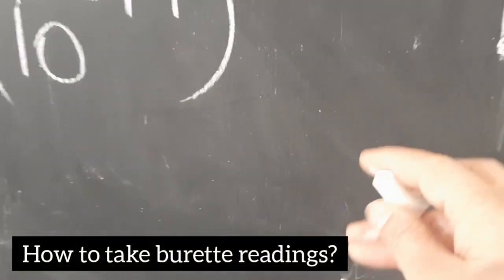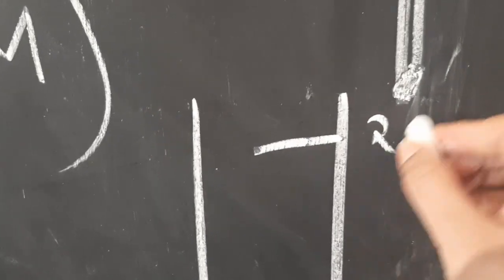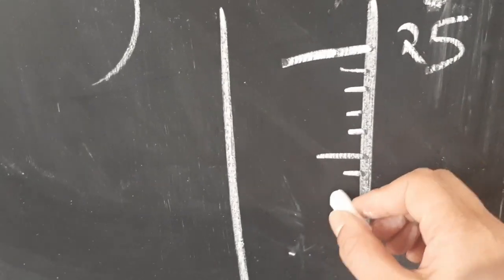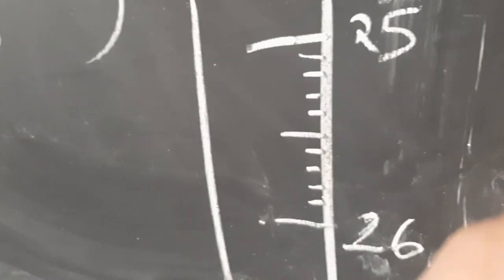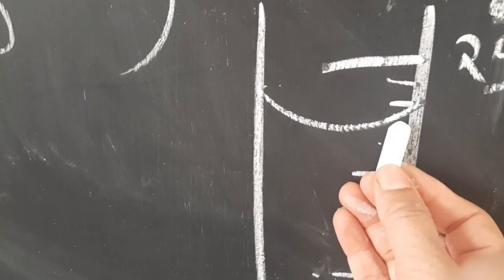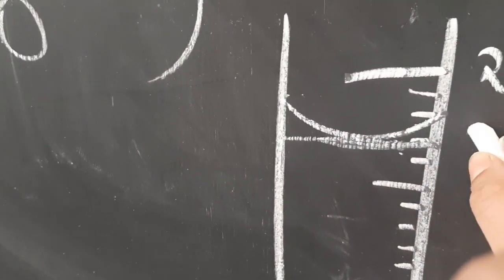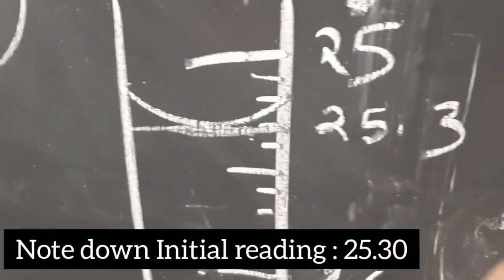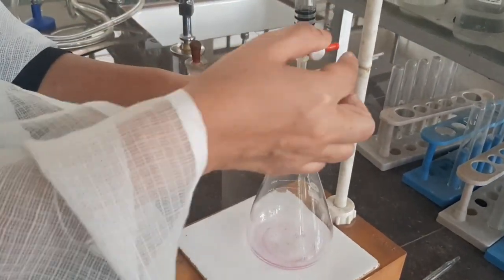Let me explain how to take a burette reading. Say this is 25 and the divisions go 25.1, 25.2 up to 26. If the lower meniscus is touching the line at 25.3, you read it as 25.3. Now I will open the nozzle and let the liquid pass drop by drop into the titration flask.